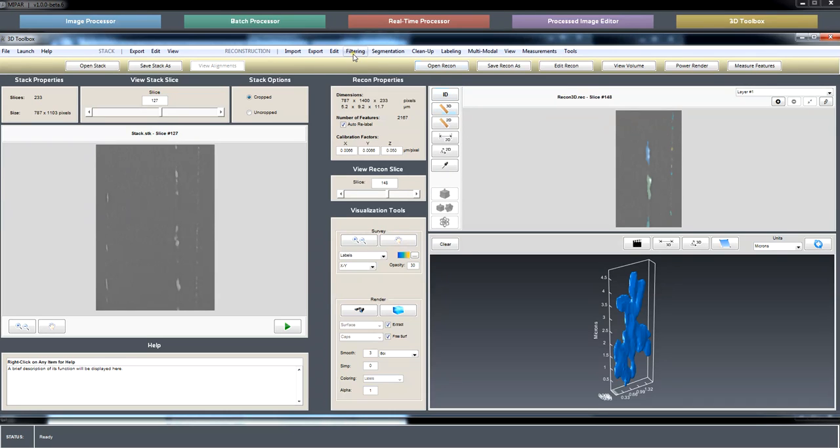VTK is ParaView, yeah, so you can manually do the export like that, or we even have this, if we want to say do a nice volume rendering on the reference data, we have this power render feature that does an export into VTK, and then this button won't be lit up if you don't have ParaView installed and sitting in the right directory, named as ParaView.